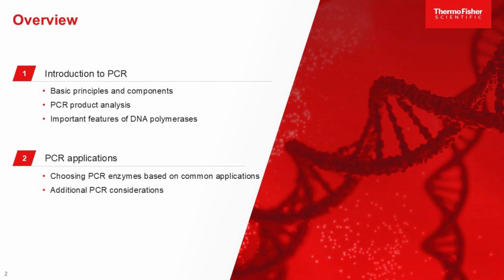Today, we will explore the essential aspects of selecting the right DNA polymerase for your PCR applications. Now let's take a look at the agenda. We will start with an introduction to PCR, covering its basic principles and components. Then we will dive into the important features of DNA polymerases and the products used for PCR. Finally, we will discuss various PCR applications and considerations when choosing the enzymes.